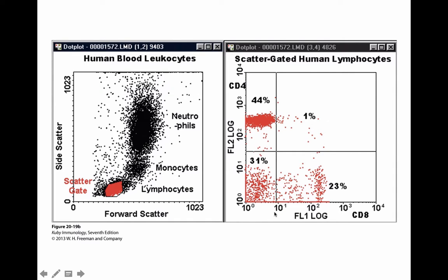It will give you a scatter plot so that you can actually use multiple different kinds of labels and tell the number of neutrophils versus monocytes versus lymphocytes, and that's just separating out the type. So there's a lot of these neutrophils here, a few of the monocytes, and here's some of the lymphocytes that are in there. So now, if we just concentrate on the lymphocytes, it can show you some differentiation between the types of lymphocytes that are detected.